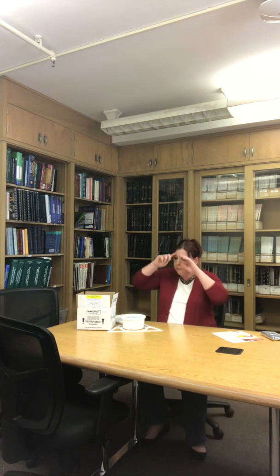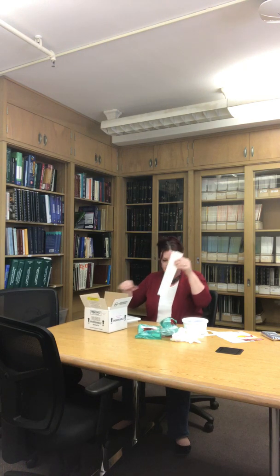All right, so let's go over the sample collection itself. I've got a first collection box here. That's what you should have to demo to your participants. It does include all three of the types of collections, the stool, the urine, and the saliva. So they're going to want to remove all the contents here. We've got some gloves, we've got the saliva collection, we've got the urine collection kit, and we've got the stool collection bag here, and a couple of tape strips.